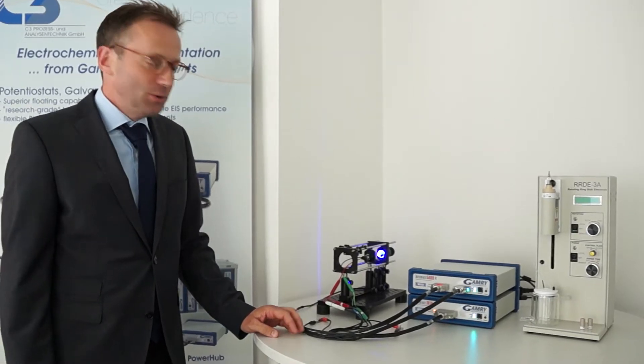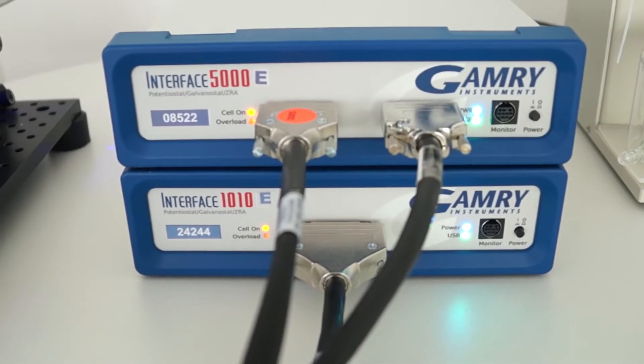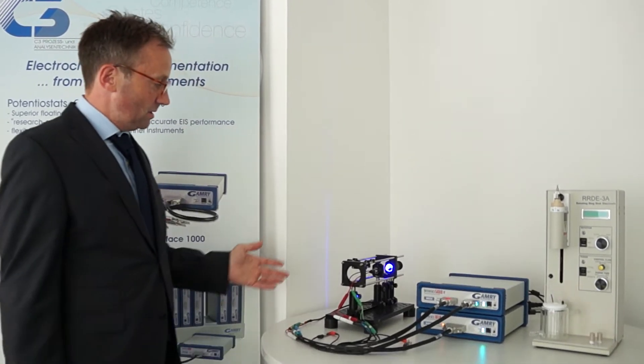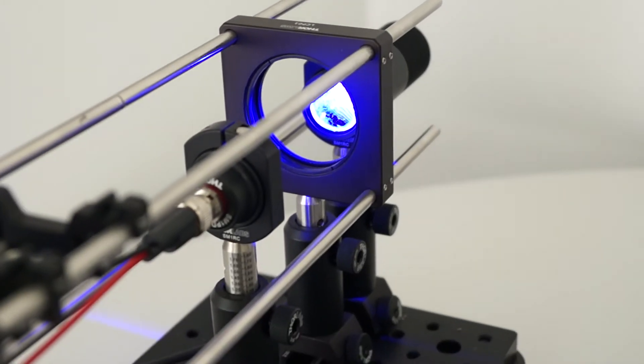One unusual example you can see here: it's a bipotentiostat setup from an Interface 5000 and an Interface 10E potentiostat running in a synchronized way to do IMPS and IMVS — intensity modulated photocurrent or photovoltage spectroscopy — which you can use to characterize your dye-sensitized solar cell or your solar cell within this setup.